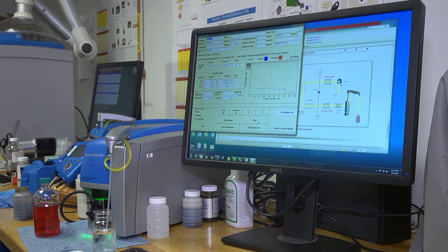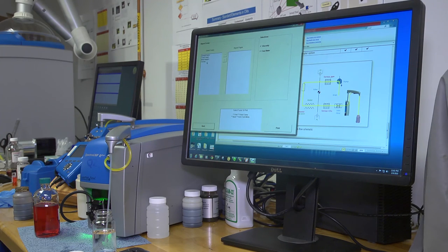So you can either print the report, in which case you get a standard selection of, or if you had made notes on a sample, you could print that. You can print the wear images. Filter out whether you just want one page or two pages of the actual wear images themselves.